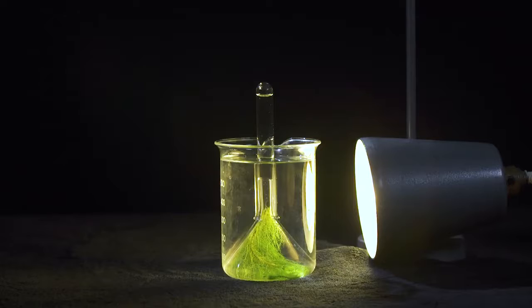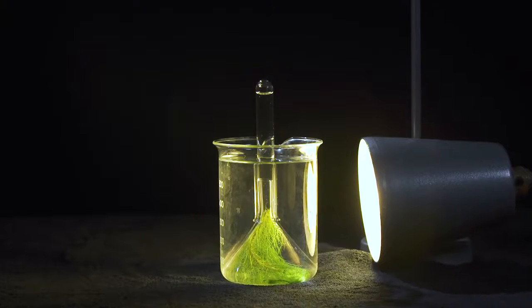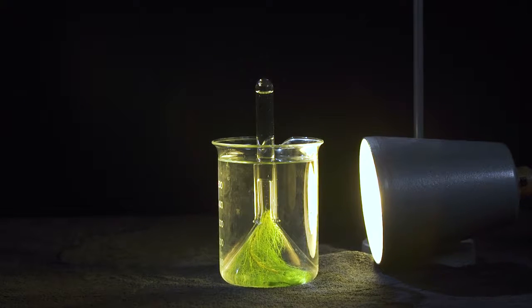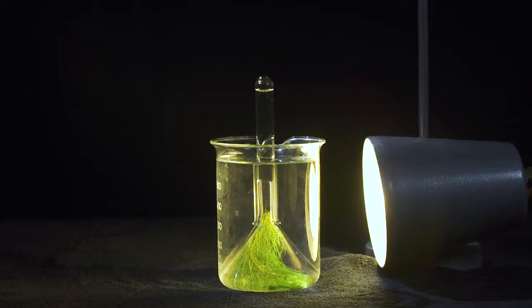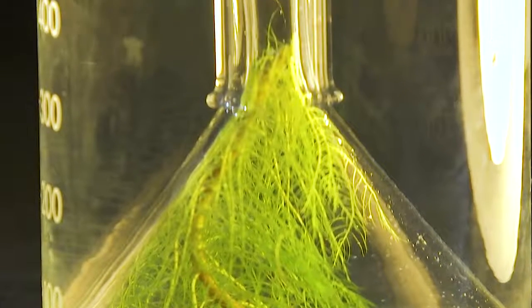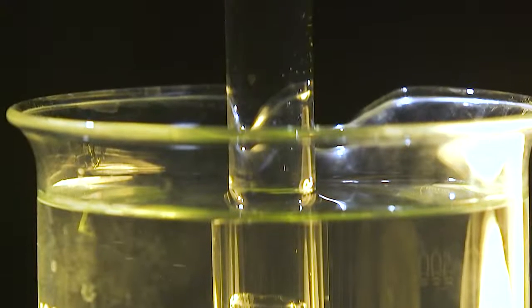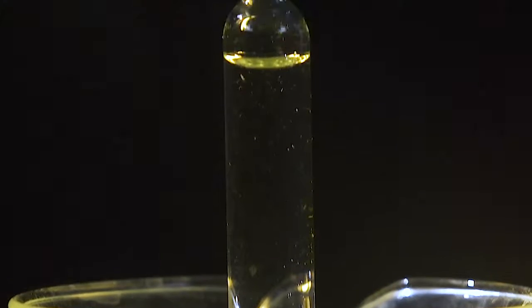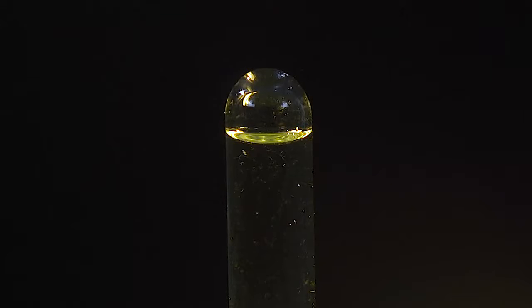This practical activity will be familiar to many people. A piece of pondweed, an aquatic plant, is turned upside down in some sodium hydrogen carbonate solution and placed next to a bright light. As the pondweed photosynthesizes, the gases produced are released from the end of the stem as bubbles. In the setup here, a funnel and test tube are being used to collect the gas that has been produced. In this video, we're going to cover different pondweeds and setups that can be used for this practical.